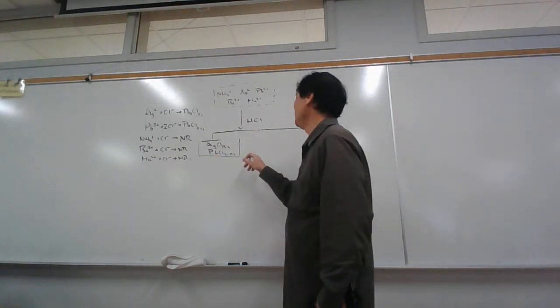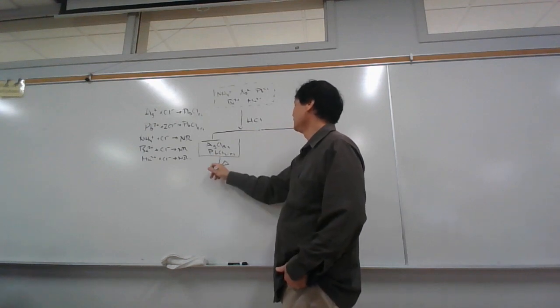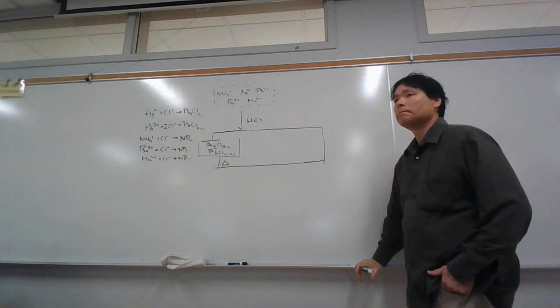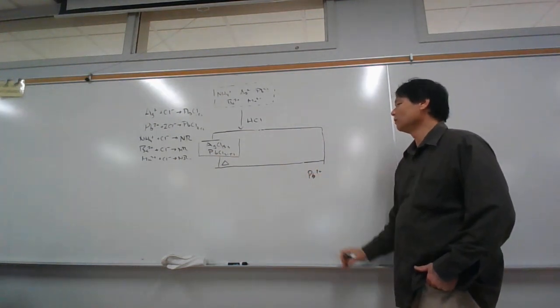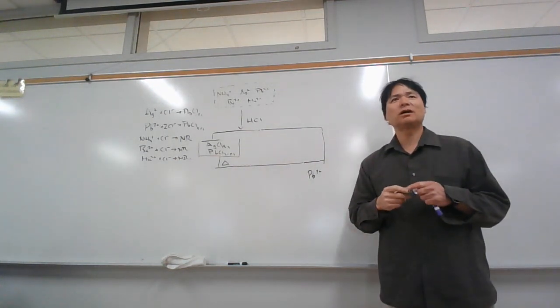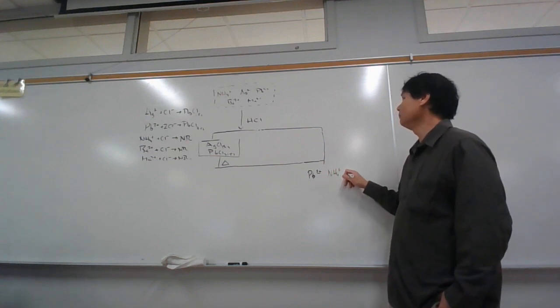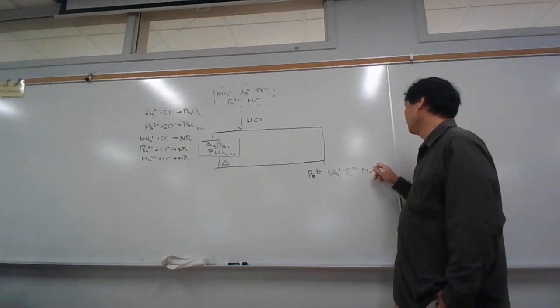And then what we're going to do is we're going to heat this up. Delta is the symbol for heat. And what's the heat going to do? Yeah, it's going to dissolve the PbCl2. We got to make sure we get it all to dissolve. So usually crush it with a stir rod or something. Just make sure it all dissolves. And then we get it back in solution. So we're going to have Pb2+, ammonium, barium, and manganese in our filtrate.